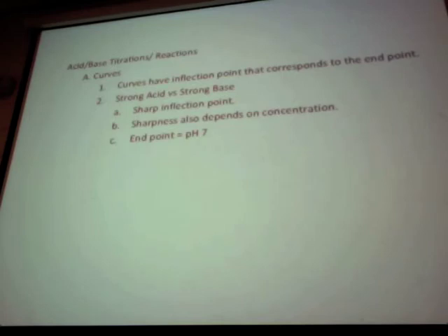After the endpoint, you're going to add a volume of excess sodium hydroxide. The little excess sodium hydroxide will elevate this end of the titration curve. A more concentrated solution will elevate more, making a larger difference. So your assignment will be like this: there's a lower concentration, and that is the highest concentration. Any question?